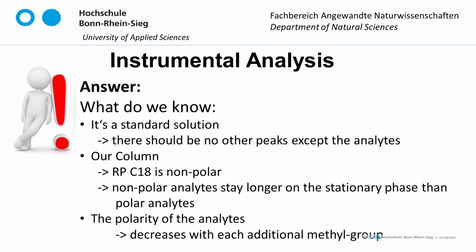Answer. What do we know? First, we know it's a standard solution. That means there should be no other peaks except the analytes. Second, we know our column. It's an RP C18 column, a non-polar column. That means non-polar analytes stay longer on the stationary phase than polar analytes.